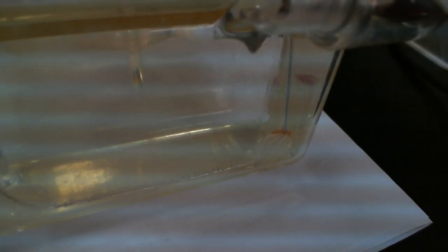Let me just take this off so I can zoom in. There are air bubbles coming off the negative electrode. Hopefully you guys can see that. Come on, zoom. Okay, there it is. So you can see air bubbles coming off the negative electrode. If you see air bubbles, that means that the current is running. So electricity is going through this, and it's going through your sample.